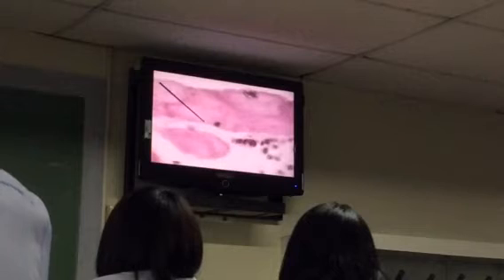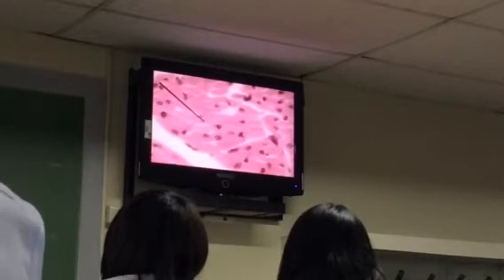Your Purkinje fiber. Look at that. Di ba? Medyo lighter ang kanyang color. It also has a nucleus, kaso halos walang striation. Kasi hindi naman ganon ka well-developed ang kanilang actin and myosin filaments as compared with this one. Ito ay cardiac muscle cell for contraction. Cross-section nga lang.